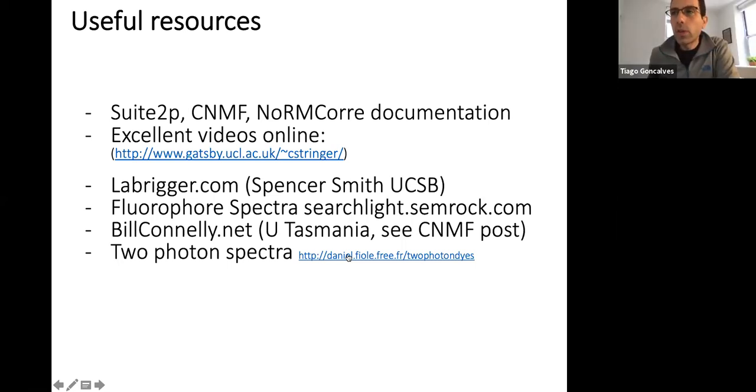Usually not with in vivo data, but people do it with data that is more static, from confocal images and so forth. In fact, some of the commercial confocal software actually do that for you automatically. So yes, it is a commonly used technique, but not so much for in vivo recordings, no.